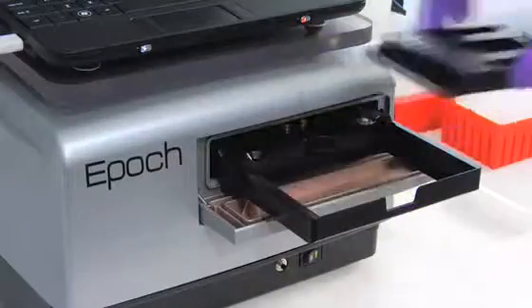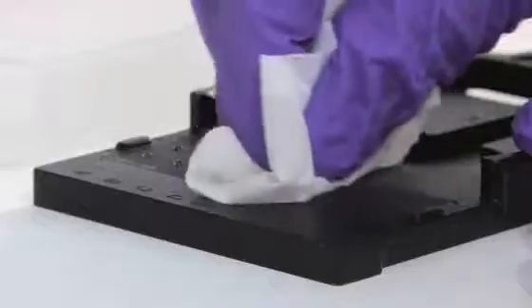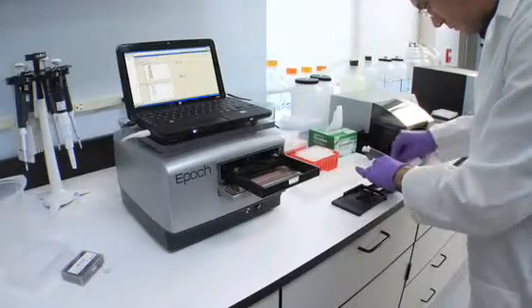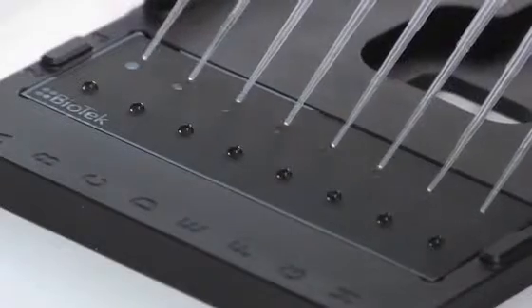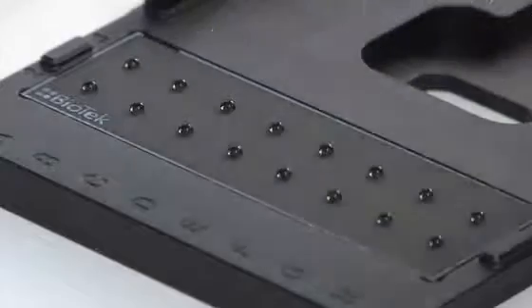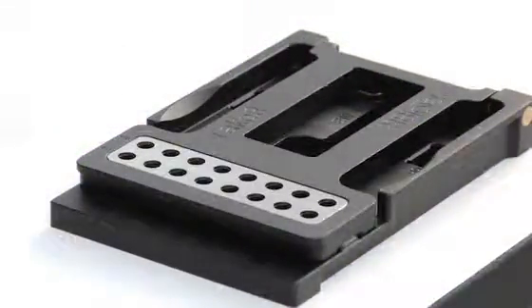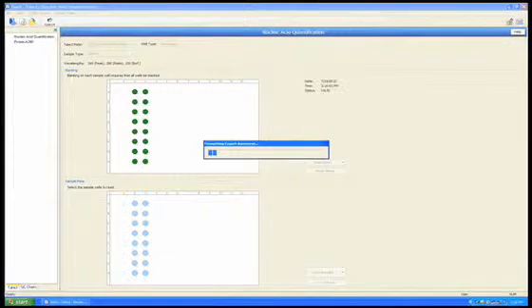After the blanks are read, the Take-3 plate is removed and the blanks are wiped off both top and bottom slides with a lab wipe. Next, pipette the samples onto the microspots. Select all 16 locations and read the plate. The results are calculated automatically and displayed in an Excel sheet.